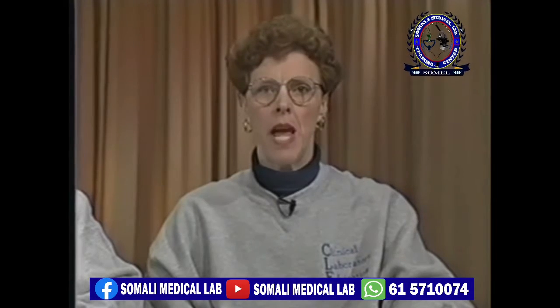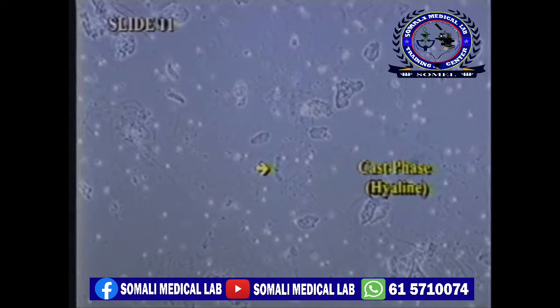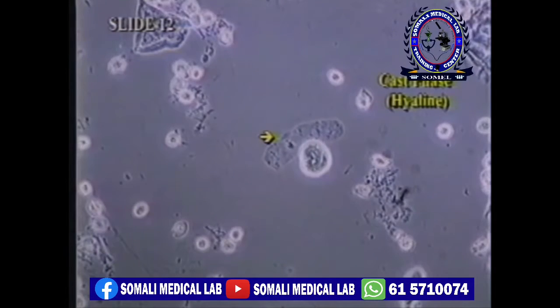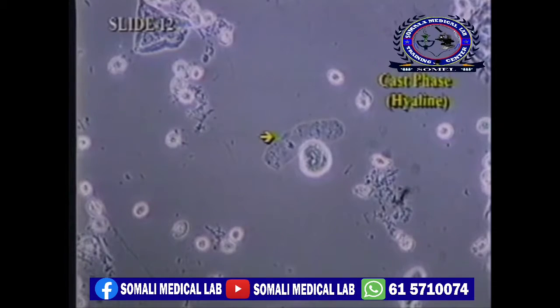We will begin with casts. Although we cannot show you every kind, we have included several different types. In this slide, under low power phase, we see a hyaline cast. This is a hyaline cast under high power phase. Although the cast appears to include a minimal amount of debris, it is still classified as a hyaline.